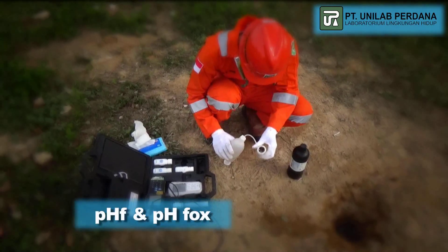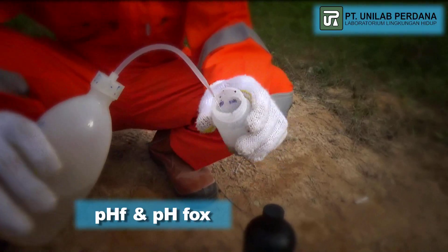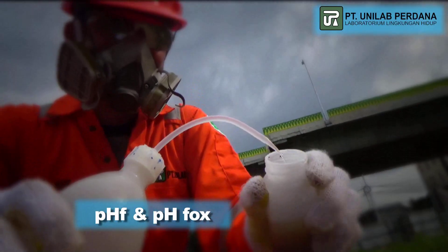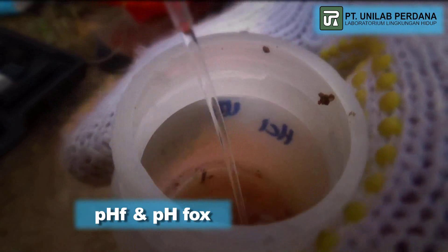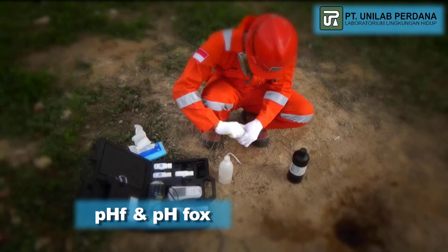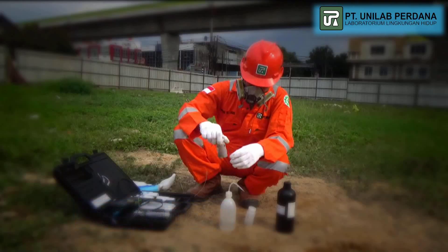The field pH and the field pH peroxide test provide a useful indication of the existing and potential acidity level in the soil. It may provide an indication of acid sulfate soil presence. They are purely qualitative, showing the acid that has been or could be produced through the oxidation process.